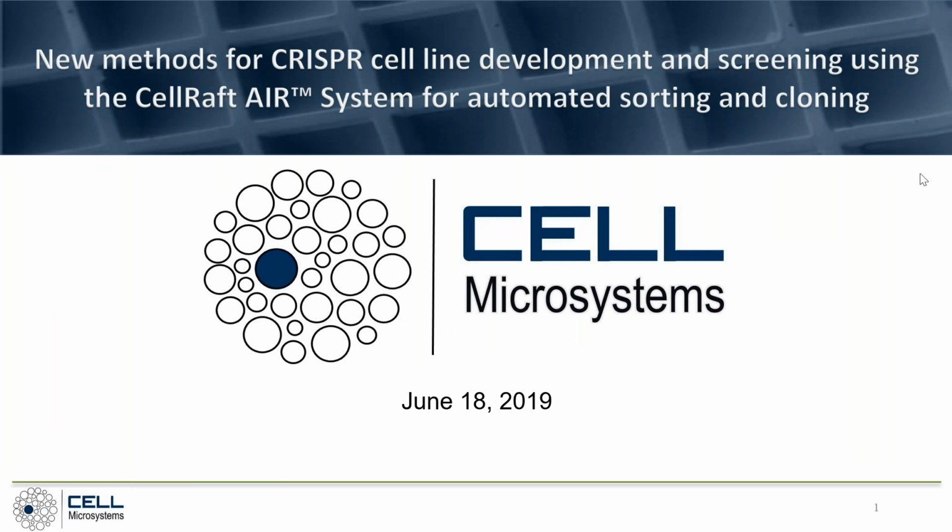Thanks for joining us. Today we'll talk about new methods for CRISPR cell line development and screening using the CellRaft AIR System for automated sorting and cloning. And we have a couple speakers joining us today.